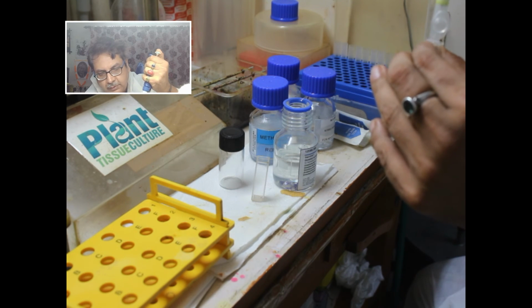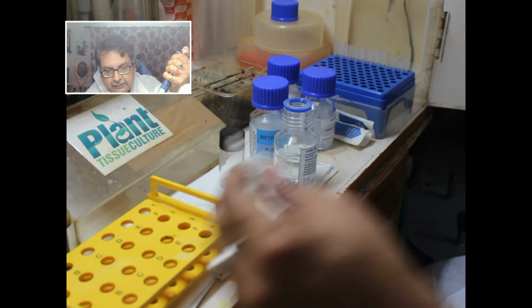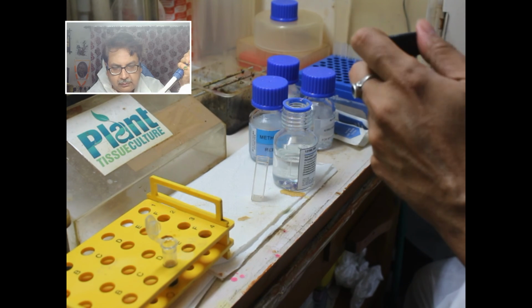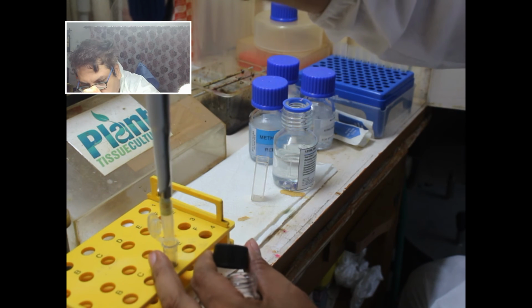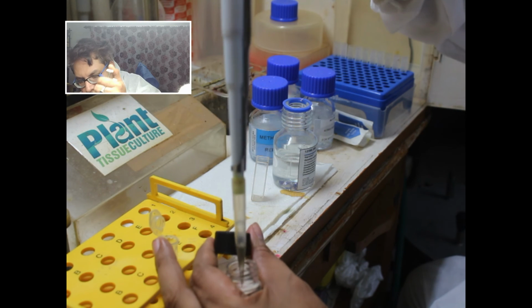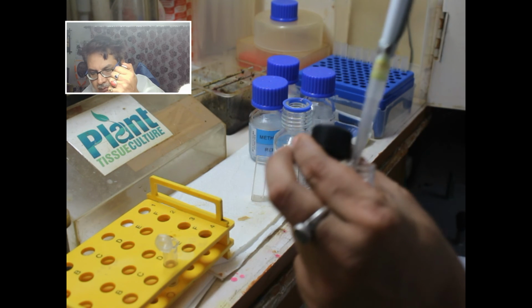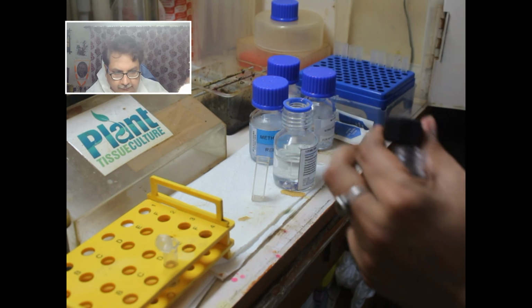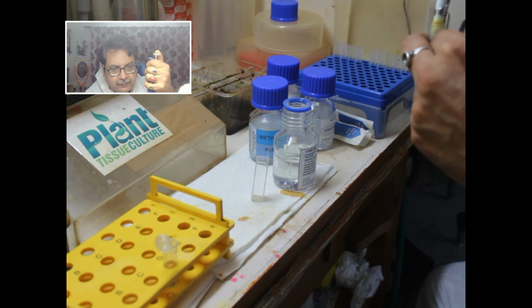No problem, just take out the mixture and put this into the leaching flask, where it will be leached and separated. All the fungal part will be there, and we have to discard this tube. Again, some DMSO is to be taken, another part of this DMSO.